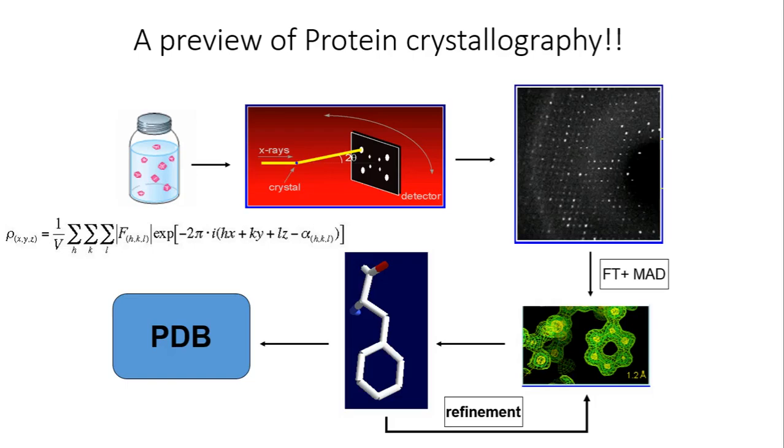The first thing that you would need to do is to obtain the crystals for that protein. Before you obtain the crystals for that protein, it is very important that you learn how to crystallize that protein.